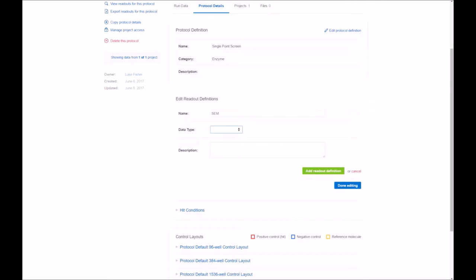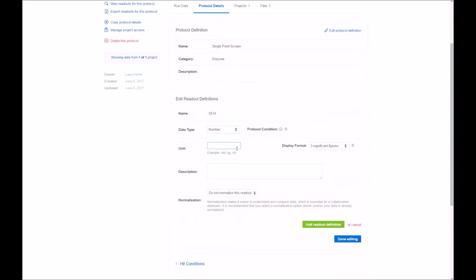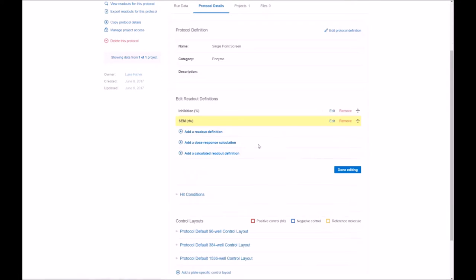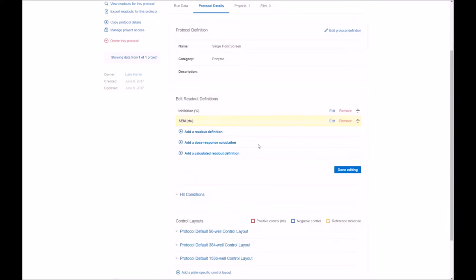Now, we'll do the SEM. Again, another number type. RFU is the units in this case. And of course, a description you can add. No normalization here either.